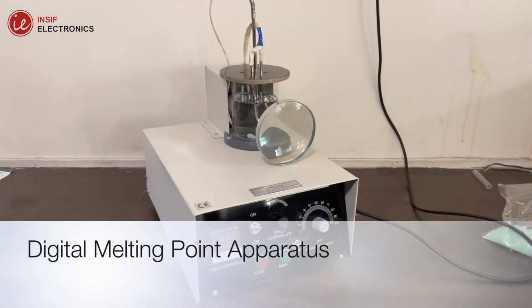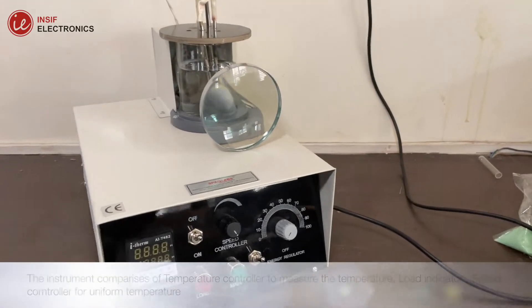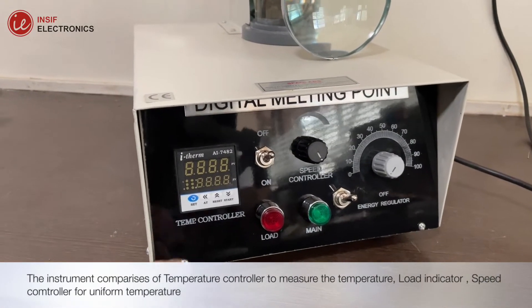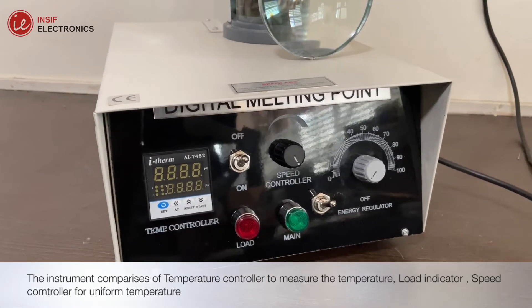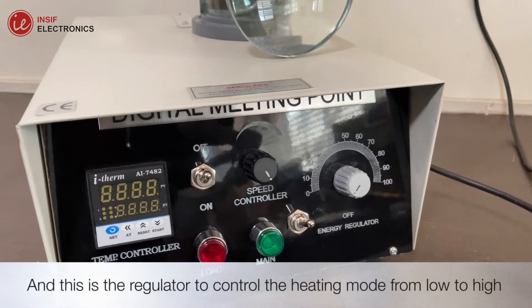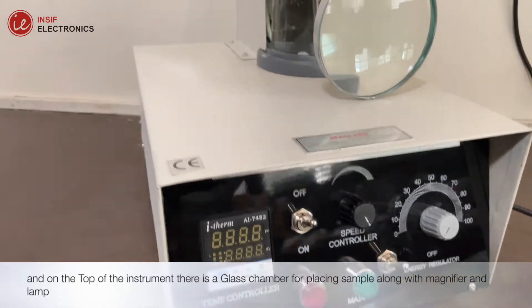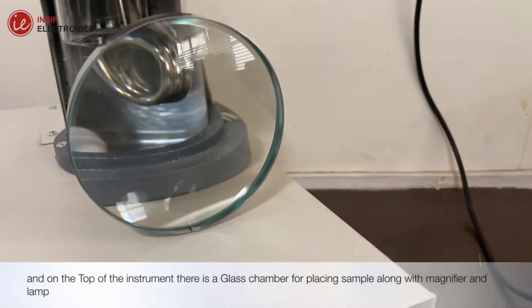A digital melting point apparatus is used to find the melting point of a sample. The instrument comprises a temperature controller to measure the temperature, a load indicator, and a speed controller for uniform temperature. There is also a regulator to control the heating mode from low to high. On the top of the instrument there is a glass chamber for placing the sample, along with a magnifier and lamp.